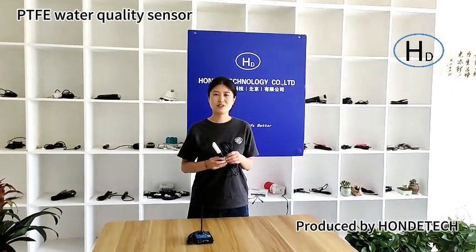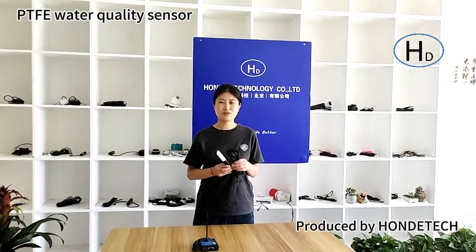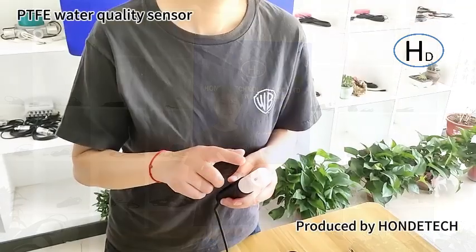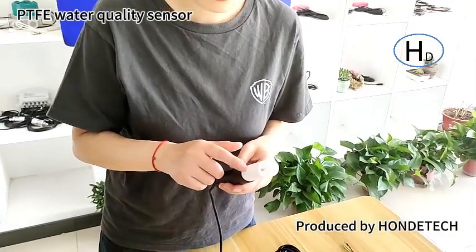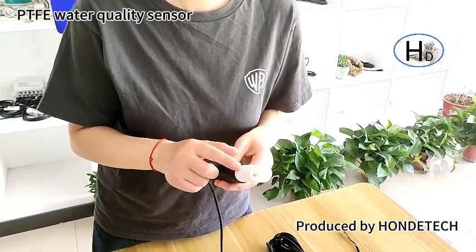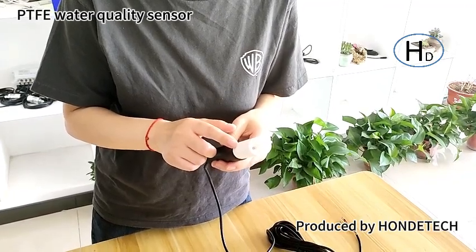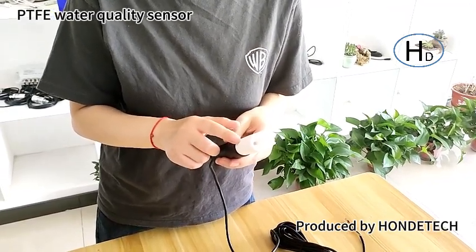Hello, I'm going to introduce the water EC temperature TDS salinity 4-in-1 sensor. The material of the sensor's probe is PTFE. It's corrosion resistant, so it can be used in sea water, aquaculture, or high acid and high alkaline water.